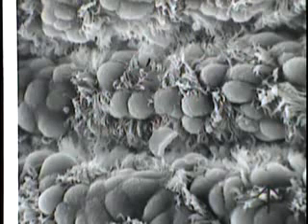So this is just a small portion of the bronchiole wall, looking at the tops of the folds that were seen in previous sections. What this scanning micrograph actually shows you are the ciliated cells. The tops of them are just their cilia. You're not seeing the apices of these cells shown here. Some here, some here, some here, and scattered around.